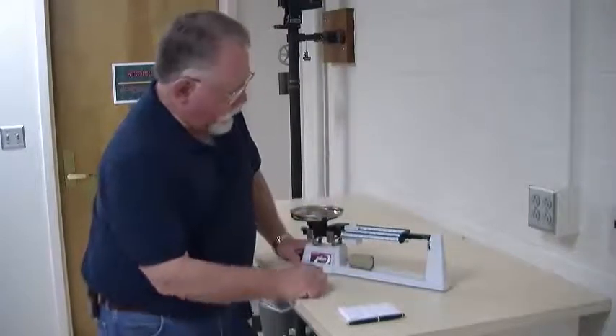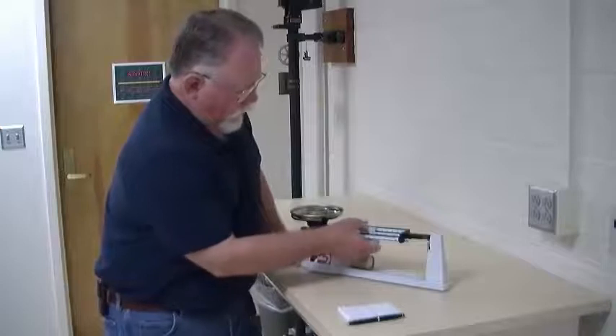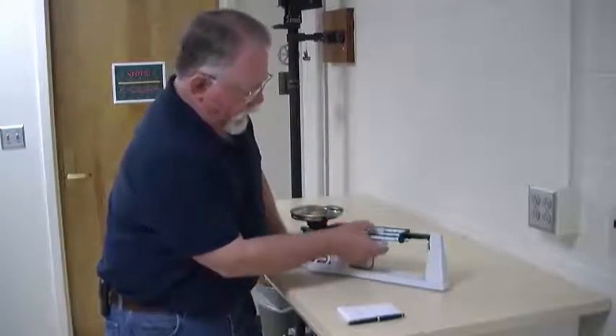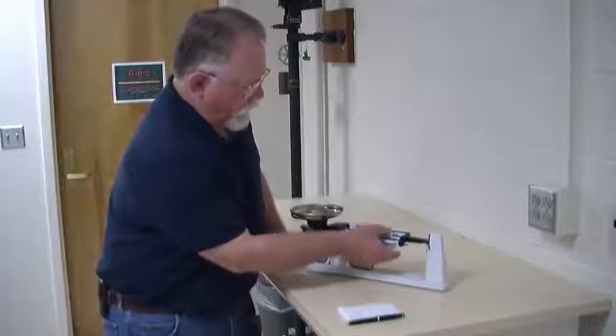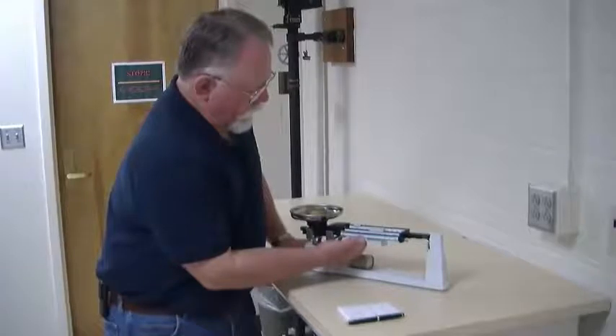Place the object you want to measure in the pan. Start with the largest poise and move it, always making sure it stops in one of the notches. When you've moved it too far, go back one. Then start with the next notch.